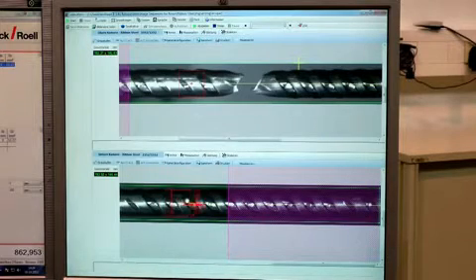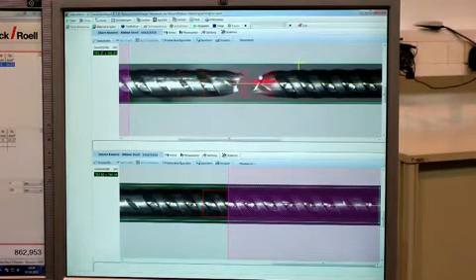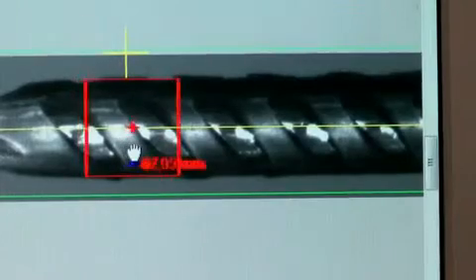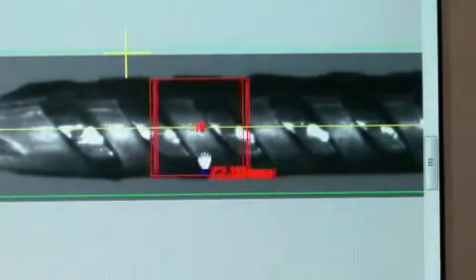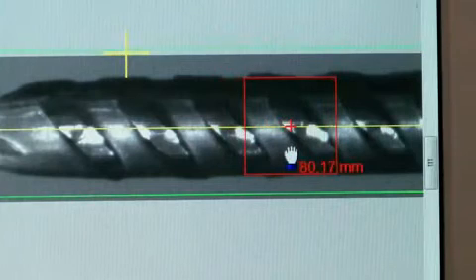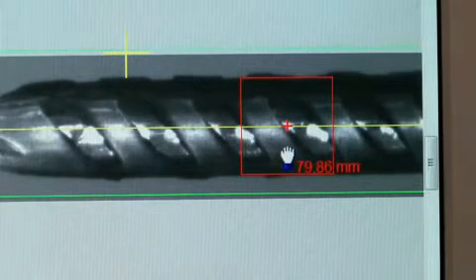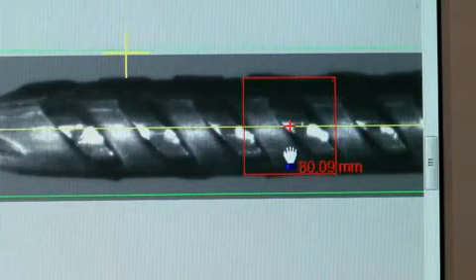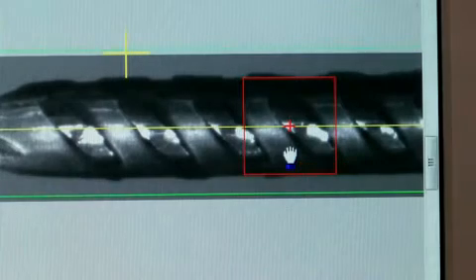As a next step we shift our two evaluation fields and position them around the necking and braking point to exactly 80mm gauge length.